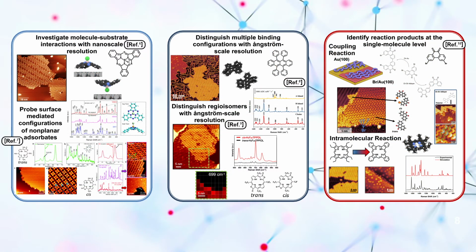UHV STM TERS enables the study of subtle, local chemical effects at the Angstrom scale. This includes molecule-substrate interactions, intermolecular interactions, and even reactions on surfaces. Here, I would like to highlight work that I've led and contributed to during the course of my PhD studies.